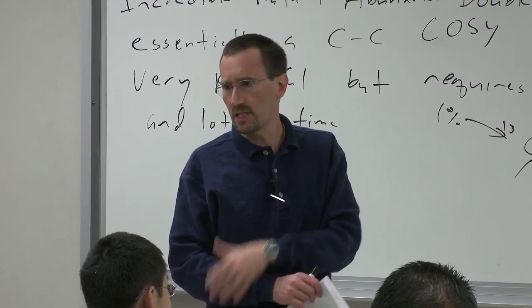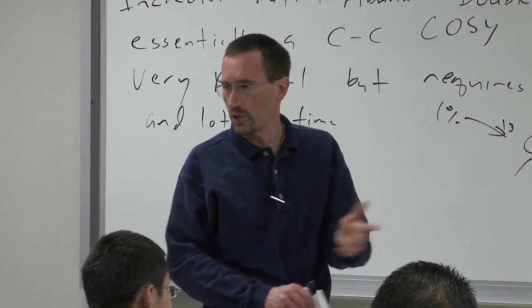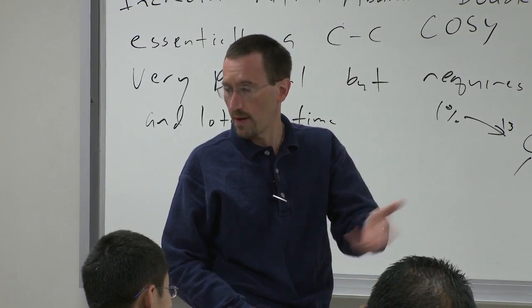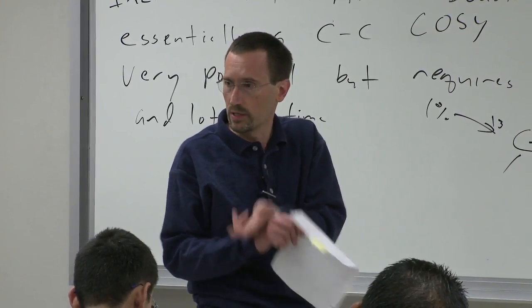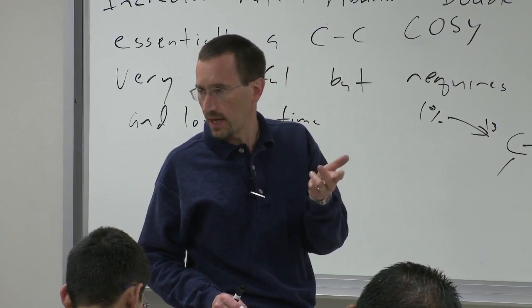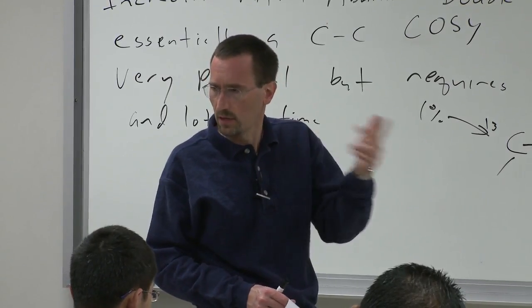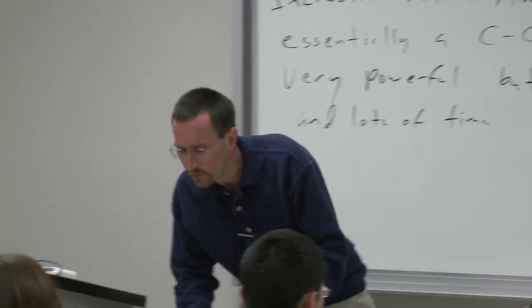The cryoprobe is like 5 or 10 times more sensitive than a traditional probe, let's say 5 times. So that's going to buy you a lot, because remember, 5 times more signal to noise can translate to cutting your experiment time down by 25 to get the same. I'm sorry, no, 5 times will cut it down by 5. But that can still help you out. So again, I'd urge you to think about this.